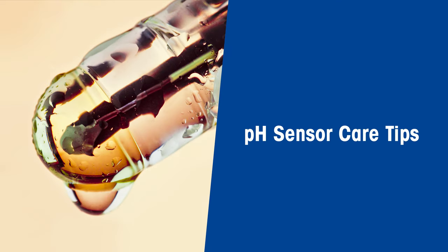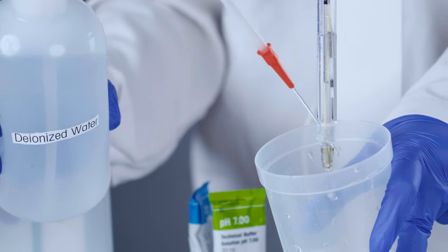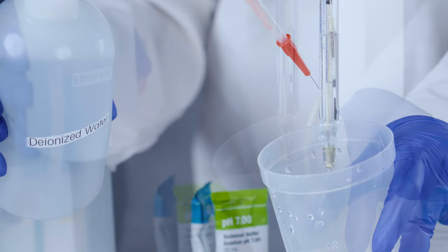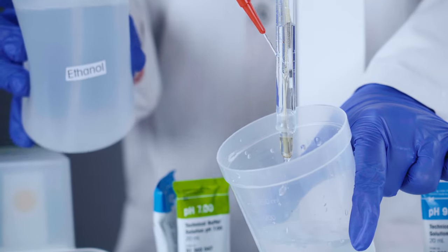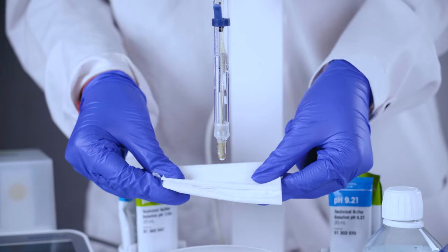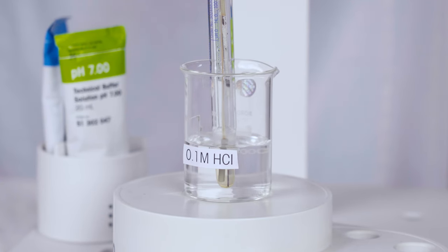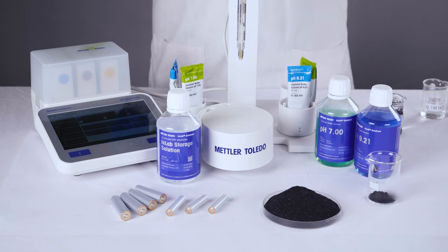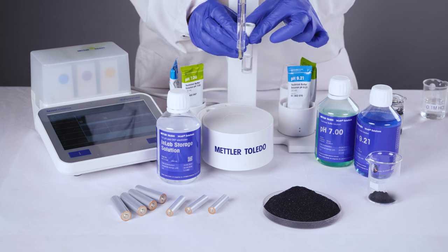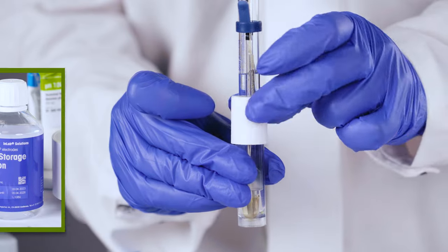How about some pH sensor care tips to keep it happy and healthy? After each measurement, give your sensor a thorough cleaning with deionized water and maybe a little ethanol or acetone to get rid of any organic matter. Just blot dry with some tissue paper and you're good to go. For a little extra care, give your sensor a periodic 0.1 molar HCl reconditioning. When you're done measuring, give your sensor a cozy home in the wetting cap filled with Mettler Toledo InLab storage solution.